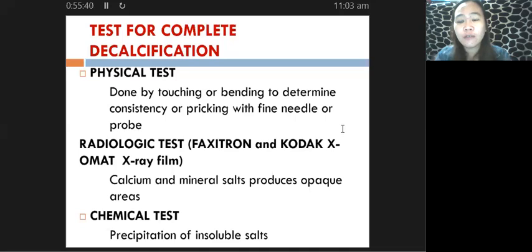If it is not necessary for this contact to happen, then you have to prevent it from happening. Otherwise, remember, overtreatment in your acid will have consequences.